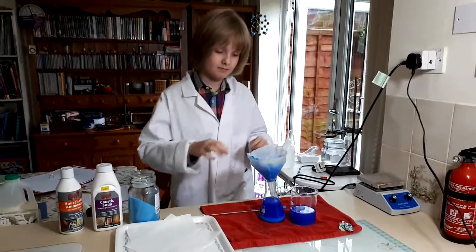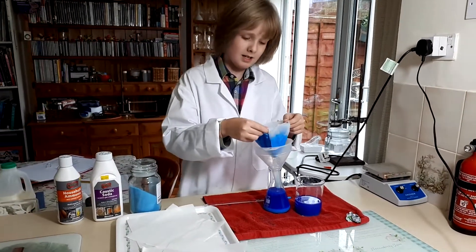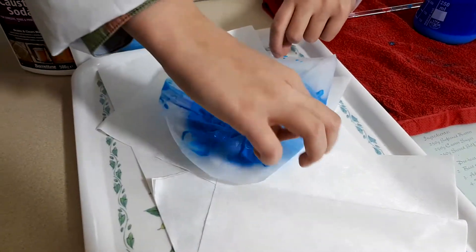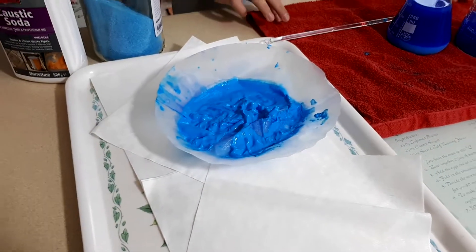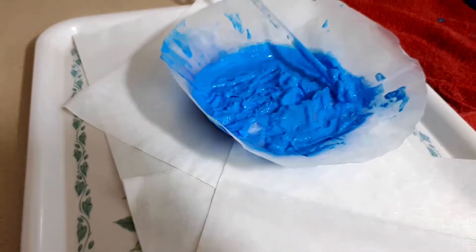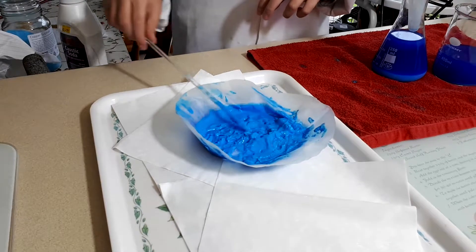The filtering's done. I can take out the filter now and put it on some paper towels. As you can see, I've recovered quite a bit of copper hydroxide from all that. There's still a paste, but when this dries it will form a free-flowing powder that I can store and use in other reactions.